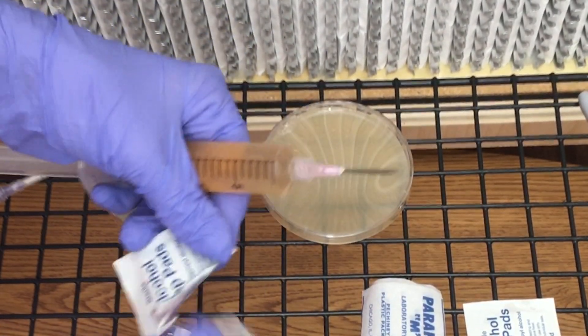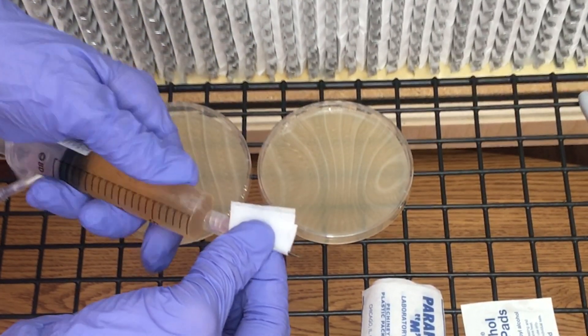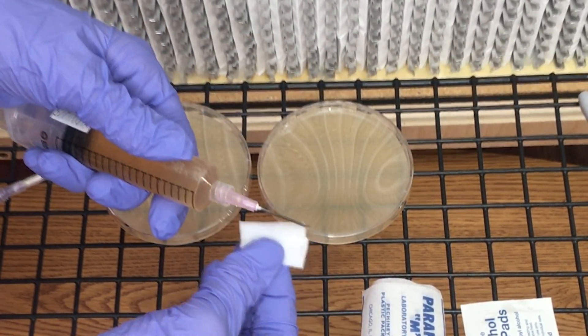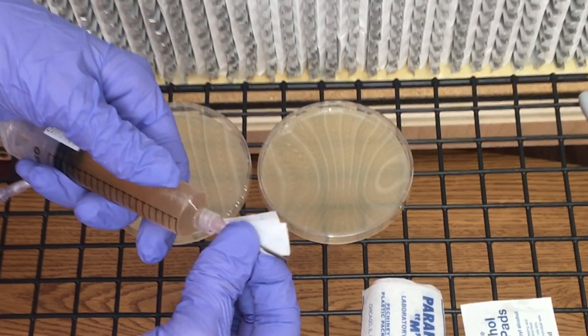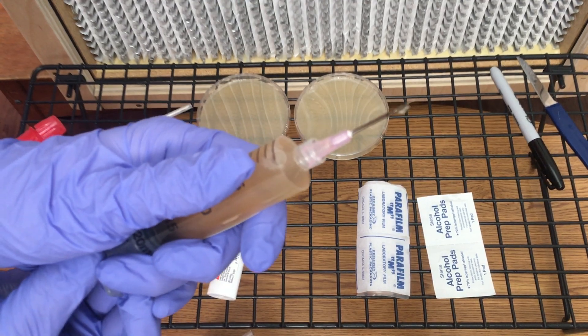Then wipe off the needle with an alcohol pad to remove the soot. Squirt a few drops of water from the tip.